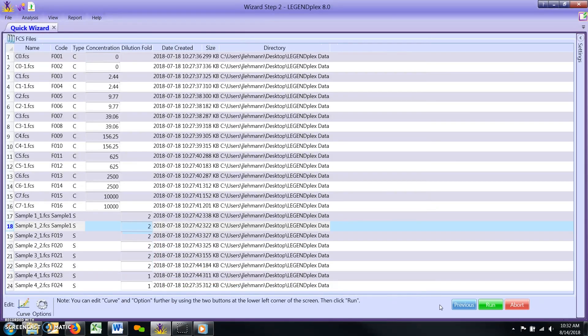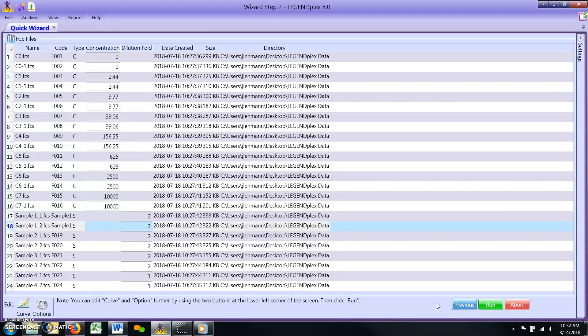Adjusting top standard concentrations. In the initial steps of the analysis, the top concentration for all standard curves is left at a default setting of 10,000 pg per ml. A large portion of LegendPlex assays do indeed have standards set to this concentration, but for some assays, it is necessary to change these values. Please consult the certificate of analysis included with your assay to determine the top standard concentrations for your particular assay.